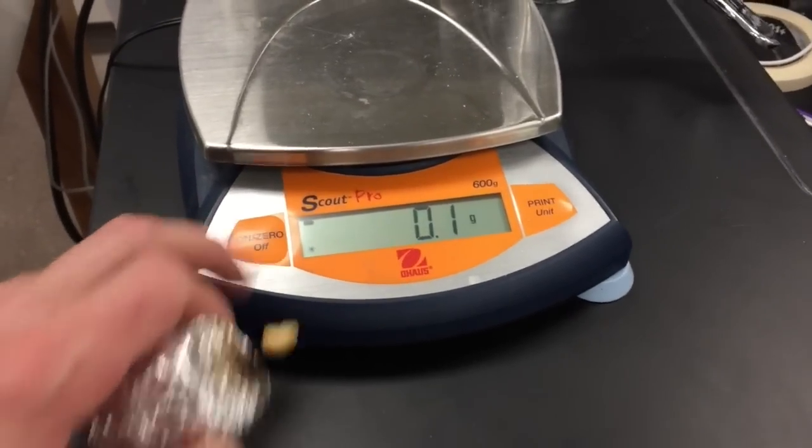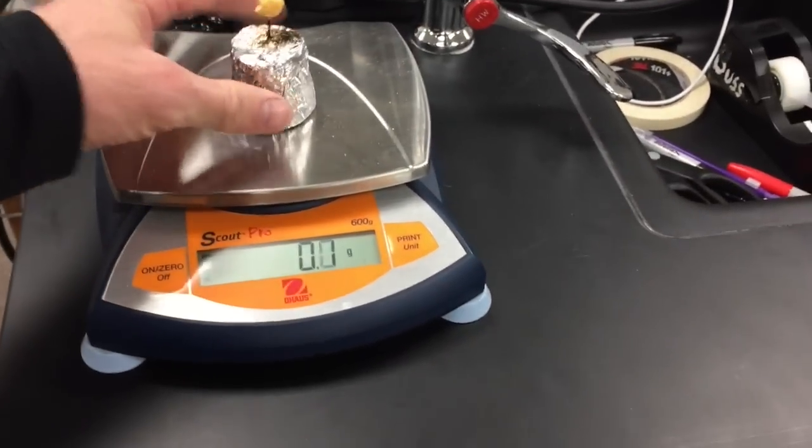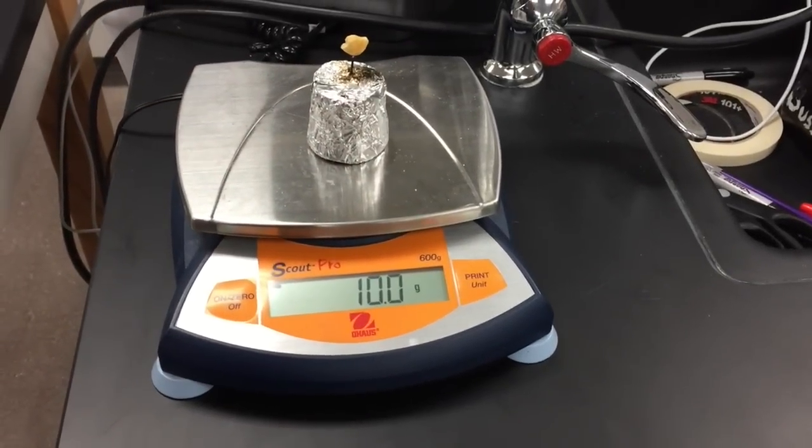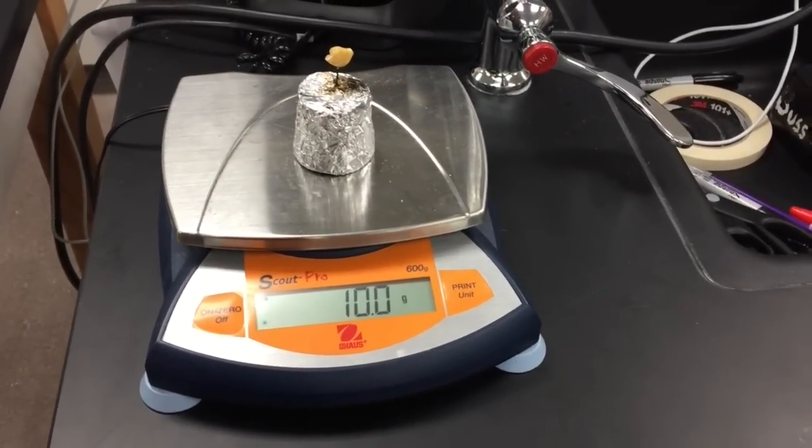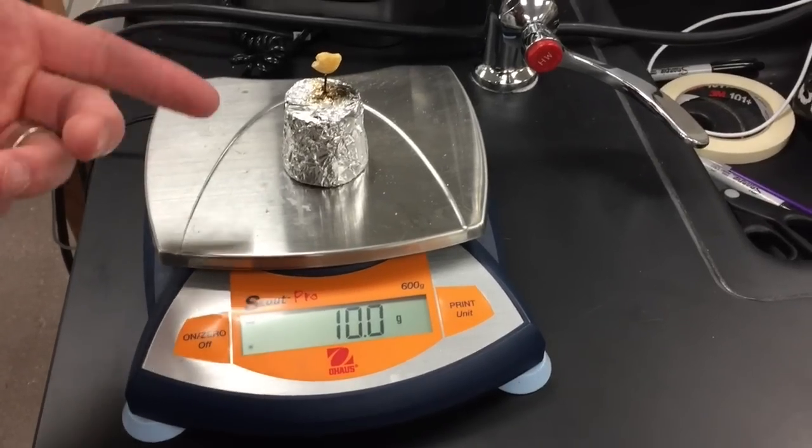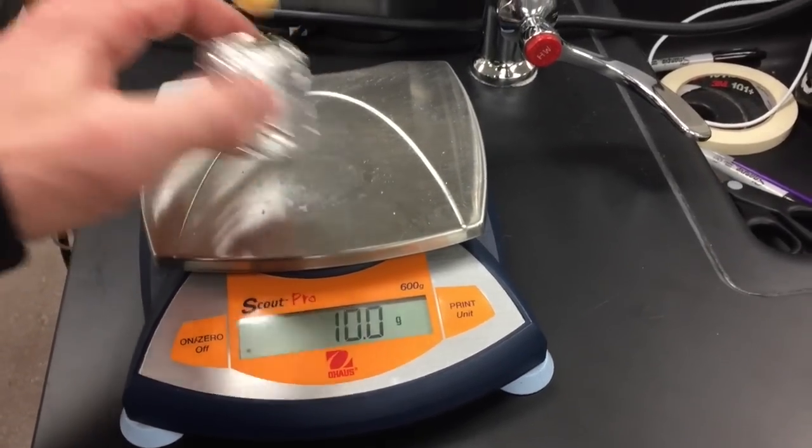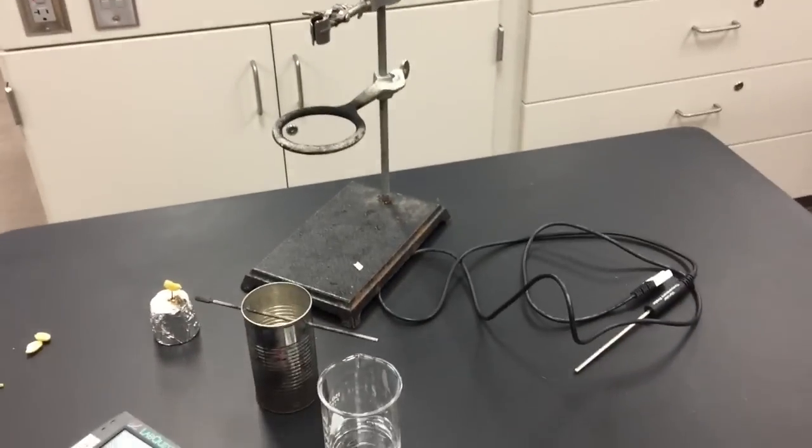Before I put it on the scale, I'll make sure that it's zeroed. Okay, so in this case I'd write down the food sample weighed 10.0 grams. The food sample doesn't weigh 10 grams, but that's what I'm going to write down as my initial weight because it's got the food sample on it.